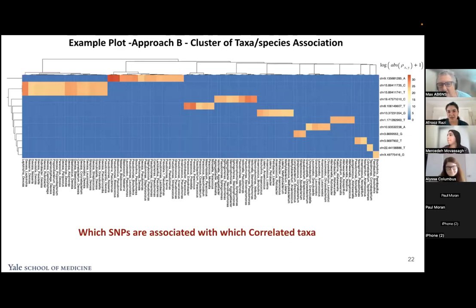Again, how do you identify the communities? The simplest way of identifying a community is just doing Euclidean distance. You can see right here, this particular Devosia, it's of different species of this genus. You can see it multiple times. They just have a secondary name afterwards.